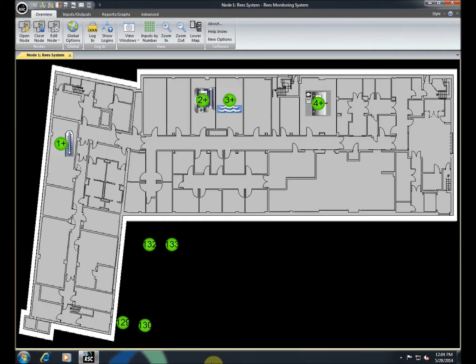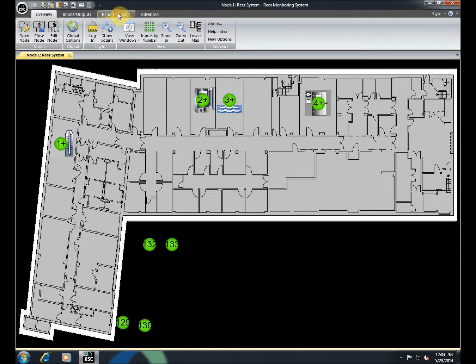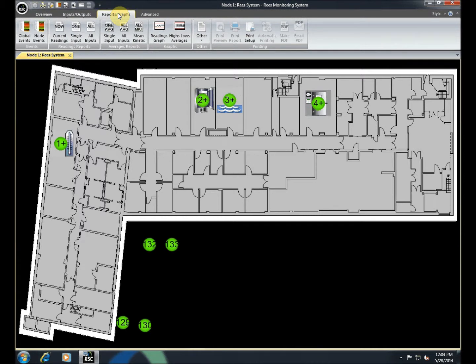One of the most important functions of the Rhys workstation is its ability to provide graphs and data about the environments it is monitoring. To view this data, click on the Reports and Graphs tab.